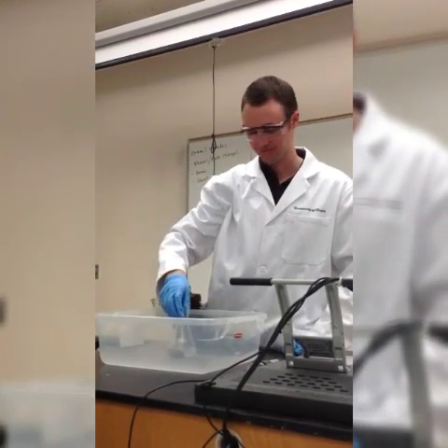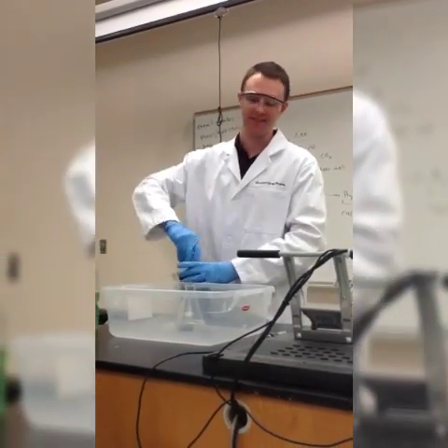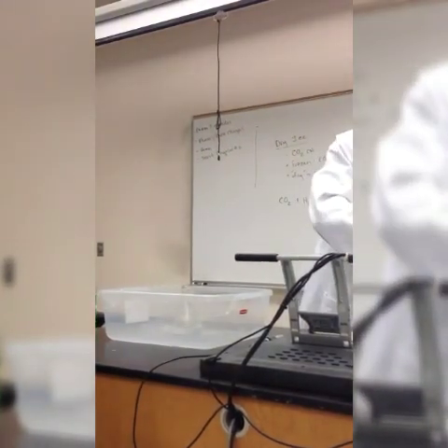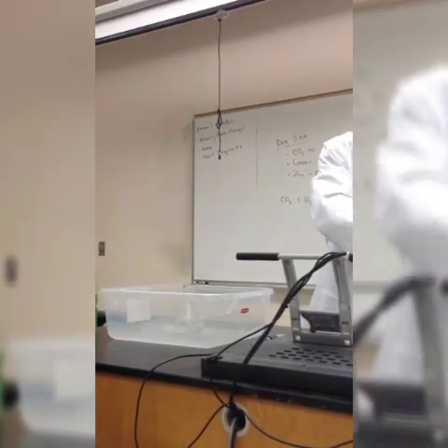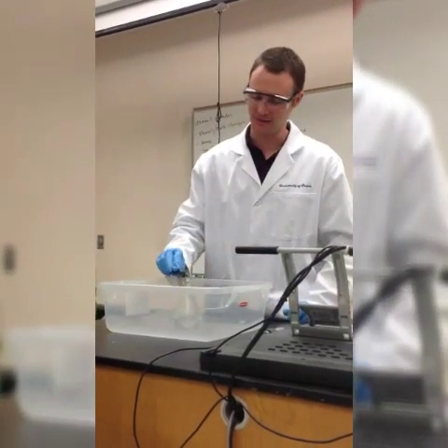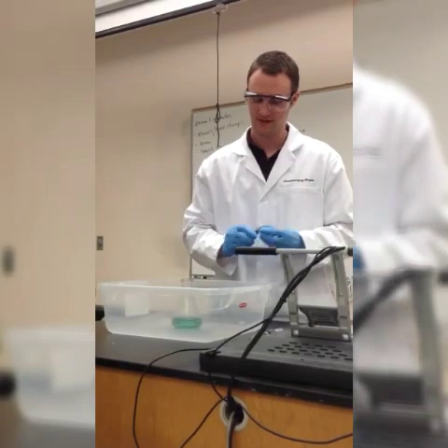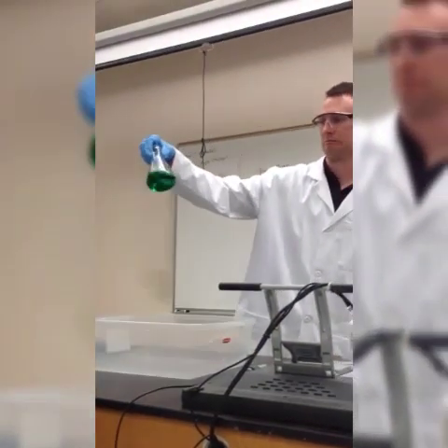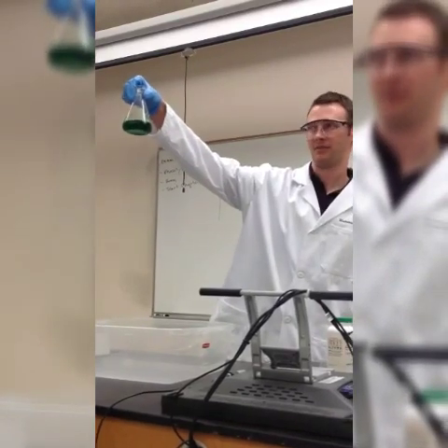So what I'm going to do, this is purely for flashy purposes, is add a little food coloring. Let's go with green. Seems like we have a lot of green going on here, just so we can see what's going on a little bit better. Did adding green do anything other than change the color? So it just kind of looks like peroxide, right?